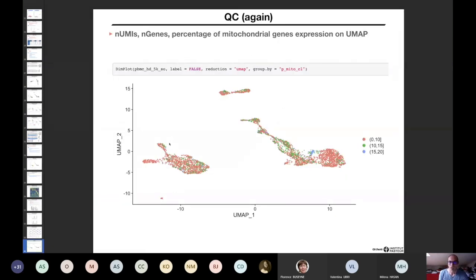Let's go back to QC now that we have nice clusters. It's also important, when you have your UMAP coordinates and your clusters established, identified at least as an ID, not necessarily a cell type, to see if they don't correspond to cells that can be dubious.